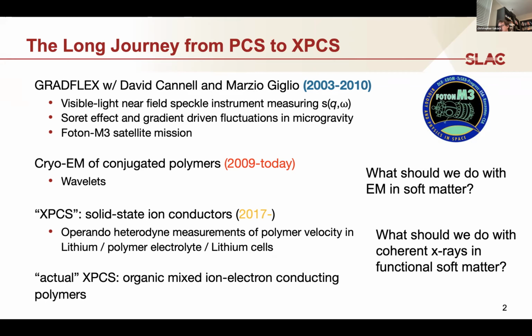Using that came about with these wavelet decomposition methods to look at these lower order correlations in their locality, and I've been applying that continuously to different systems today. And I would say that was really important when we went back to XPCS. It was actually Sunny who called up Mike Tony and said, hey, we should do something with XPCS. After a lot of trial and error, we came up with something, and I'm putting XPCS in quotes here, where we used a heterodyne measurement to effectively measure the velocity of a polymer network in order to understand and infer lithium ion motion in polymer salt electrolytes.